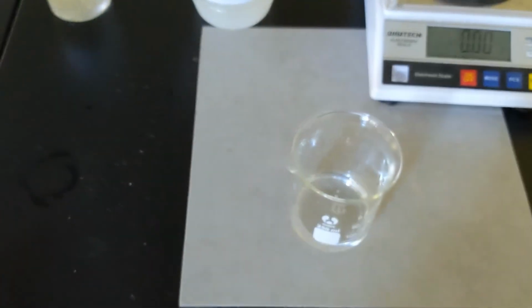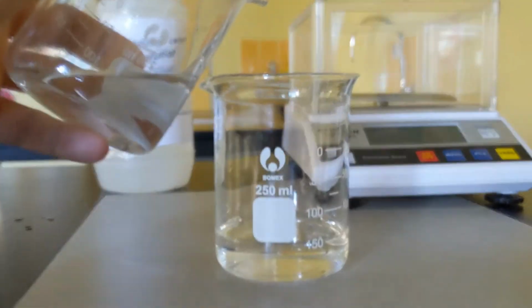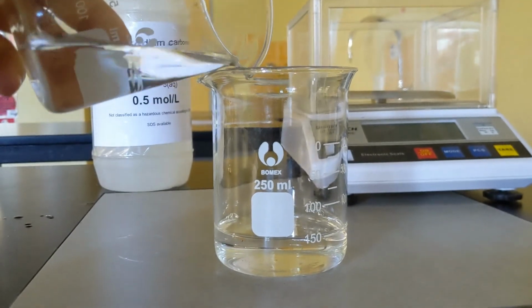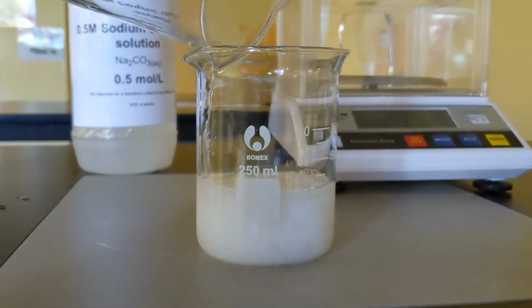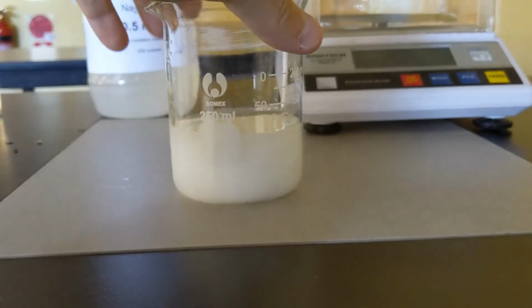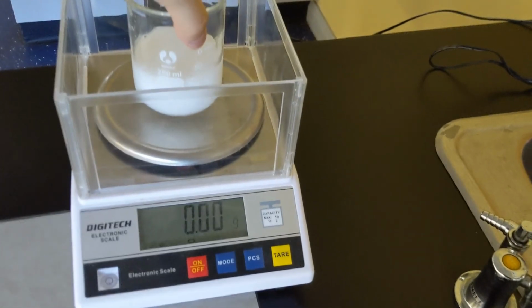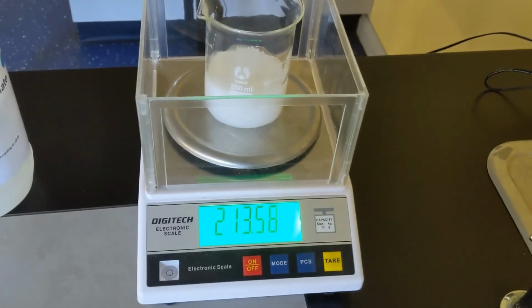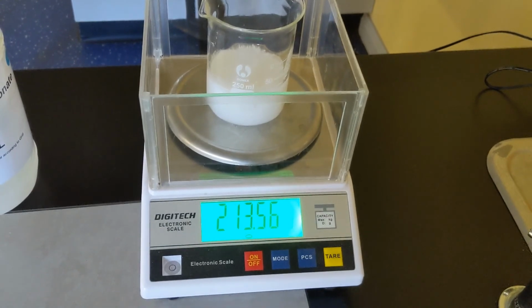So I believe that was the carbonate first, calcium nitrate to follow. What we'll see is the formation of a white solid precipitate. But at this point, all the contents of both solutions are now in the beaker. We can then take this mass, and in a moment, we'll take that mass, 213.56, and put it in our table.